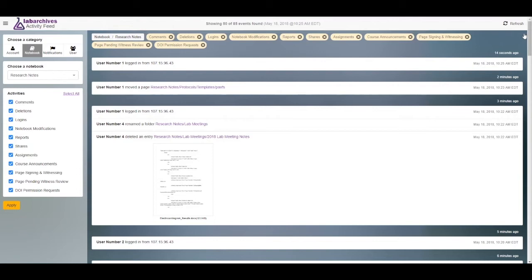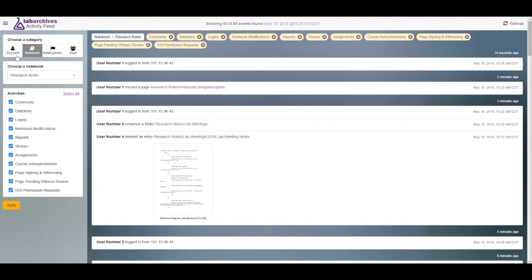The Activity Feed is organized through categories of Account, Notebook, Notifications, and User. The Account and Notebook categories will show activities in the notebook like deletions, logins, notebook modifications, and page signing and witnessing.